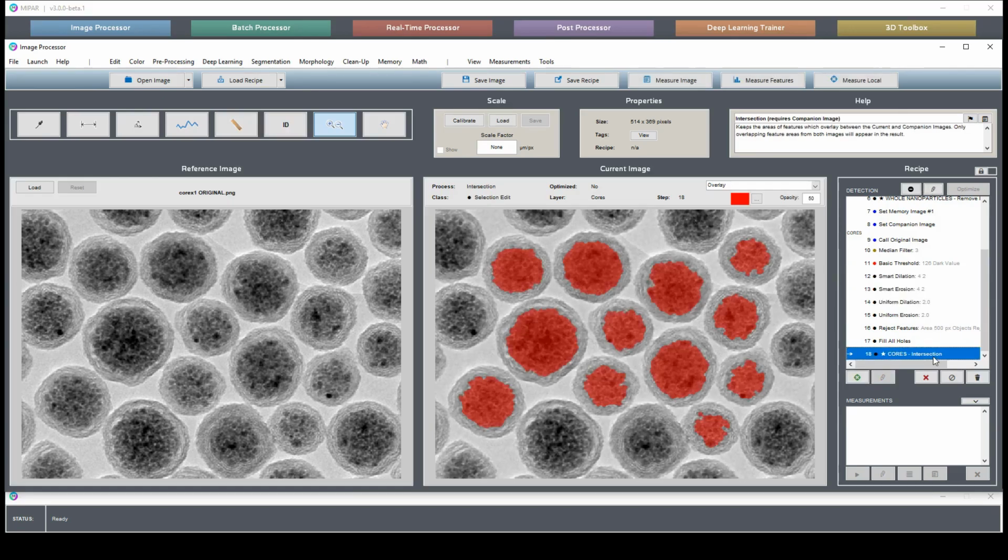So here's what we'll have, and for our purposes we'll say this is where we want to have this trade-off be. You'll have to make that decision on your own for your individual applications.